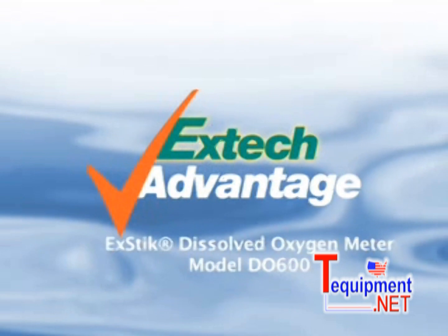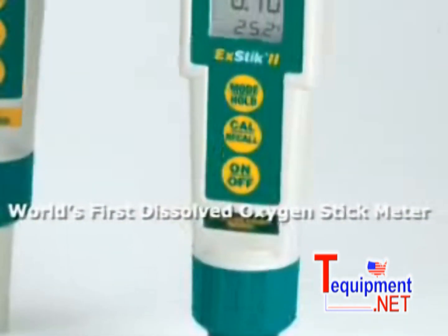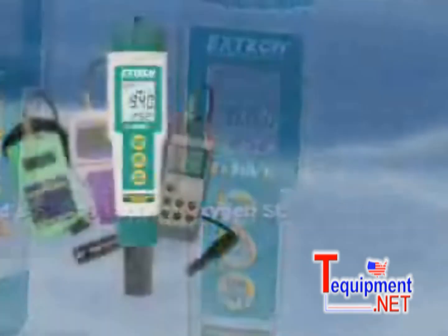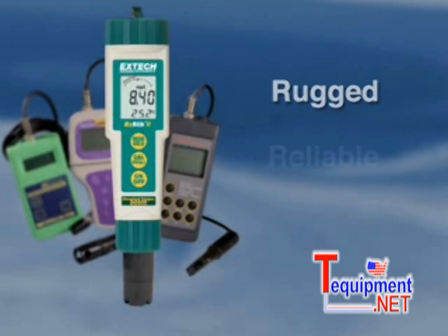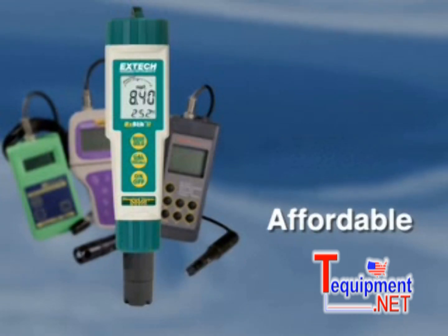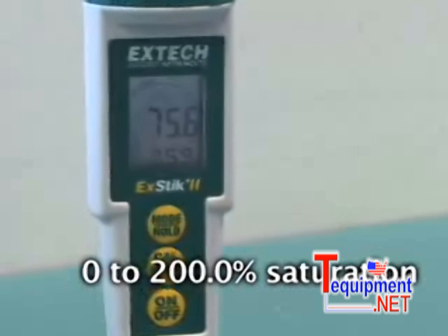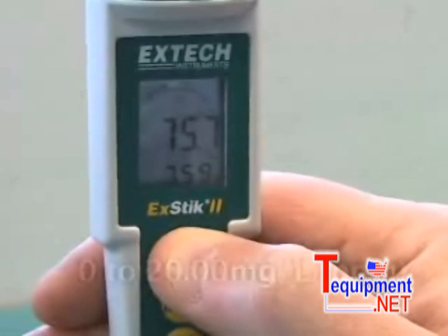Announcing the world's first dissolved oxygen stick meter, designed by Extech's leading engineers. The Extech dissolved oxygen meter offers the same functionality as a regular handheld DO meter at a fraction of the cost, without compromising the quality or accuracy of the measurement. The DO600 displays the oxygen level as percent saturation and concentration levels in milligrams per liter, or parts per million.